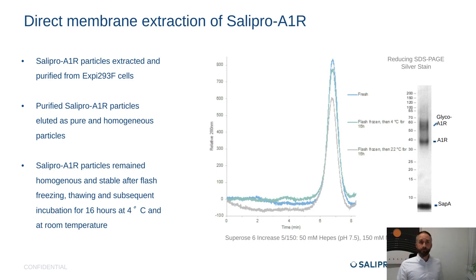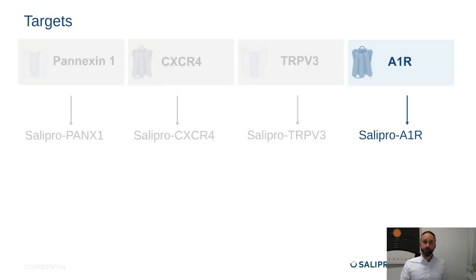So these were the 4 targets that we selected, and then basically shipped them to Ieva, and then from here on, Ieva will present to you more about the general setup of cryo-EM, and then more specifics on the drug targets that we investigated.